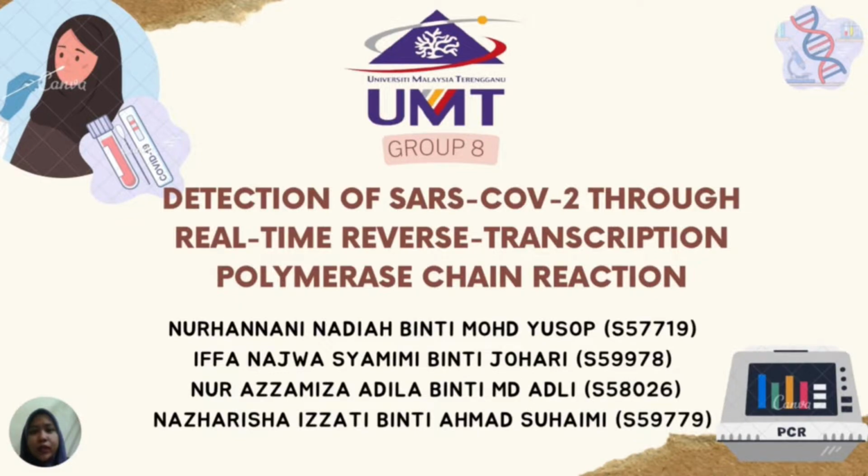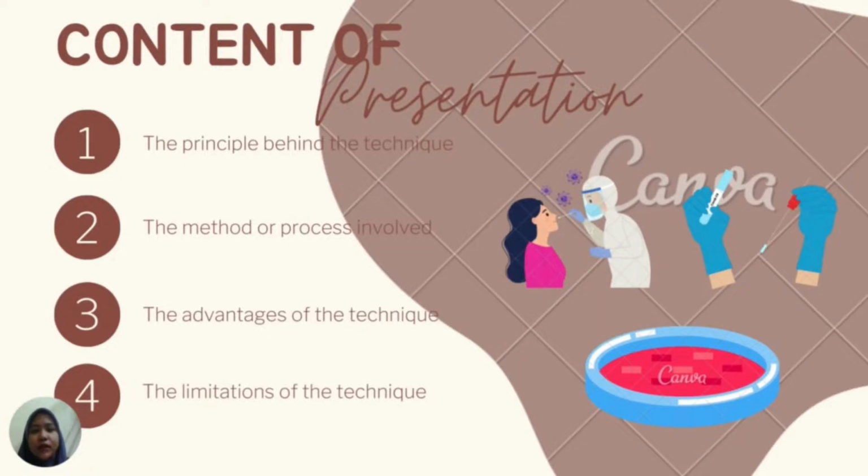Today we are going to explain about detection of SARS-CoV-2 through real-time reverse transcription polymerase chain reaction. The content of the presentation is the principle behind the technique, the method or process involved, the advantages of the technique and the limitations of the technique.